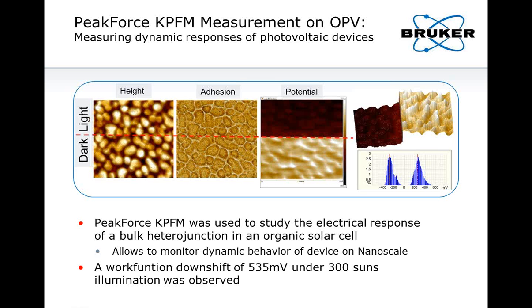In the middle of the image, the light was changed from being on to off, and you can clearly see your device responding, as judged by the change in the work function signal here by about half a volt. And that's of course great, because it allows you to monitor device performance on the nanoscale.